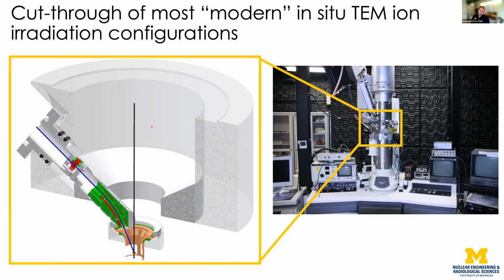You would imagine that degrades your resolution and your optics. It does a little bit, but not significantly enough, because we're very infrequently doing high resolution microscopy, right? We're doing typical strain-based contrast, things that you learn, that you can image dislocations, but rarely actually do unless you're doing stuff on structural materials and that type of process. But this configuration is quite common.